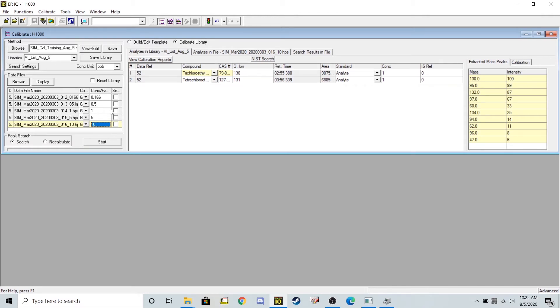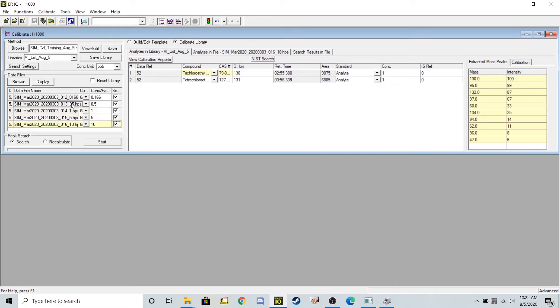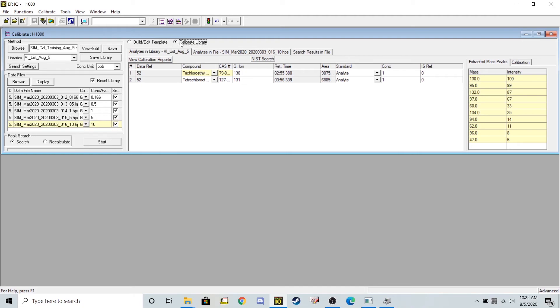Now in order for my method to reference those data files, I need to go ahead and hit selection for all those different data files. We're going to reset the library, so it just reruns all these concentration levels. Make sure you have calibrate library bubbled up here. It's already bubbled in mine. And I can go ahead and click start.